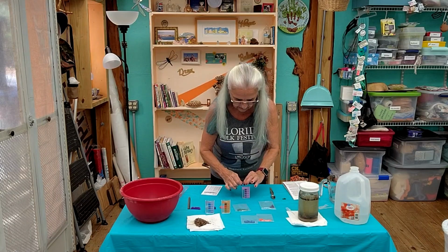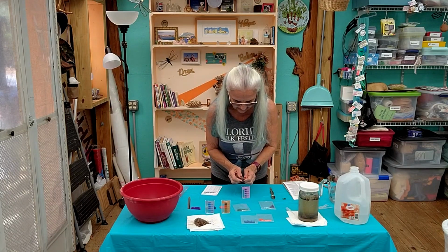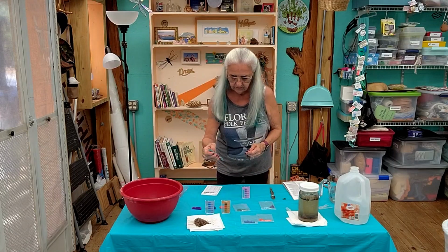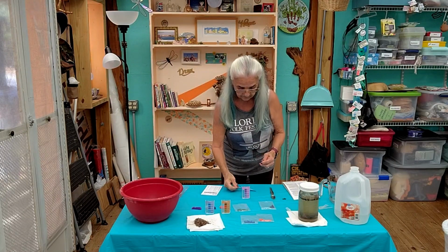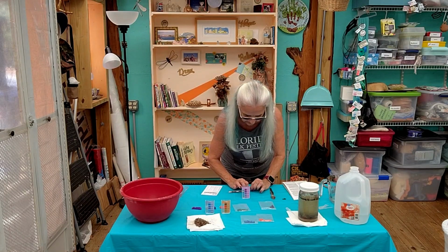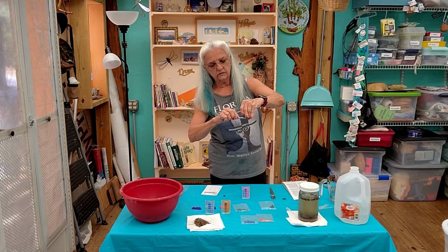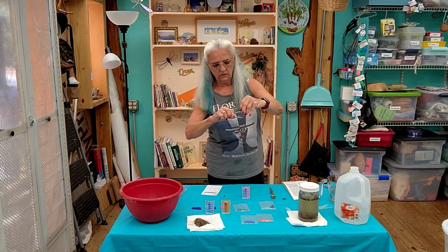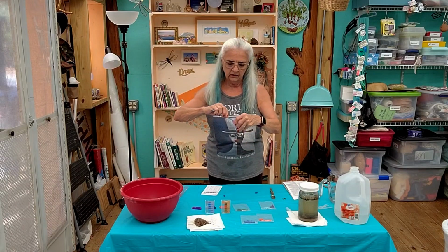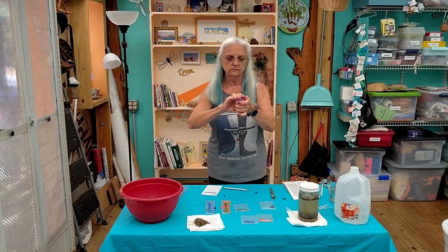So this has a lot of nice directions with it. It also has a chart that if you're growing a particular plant, herb, or bush, it tells you where. I'm trying not to spill this everywhere. I know what I'm going to do. I'm going to use this little scoop and put it in here because I'm worried about making a mess and not getting all of the product in. So we do this, and we'll take that and put it in here. Then I put my purple cap on and shake.